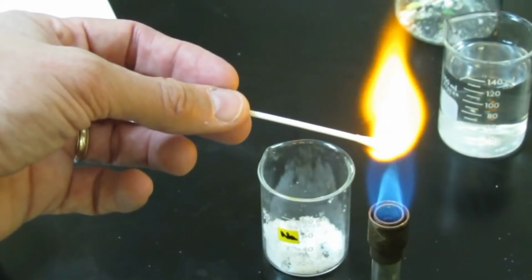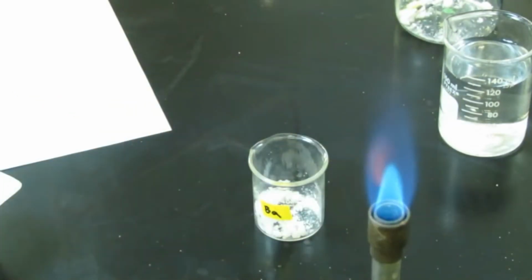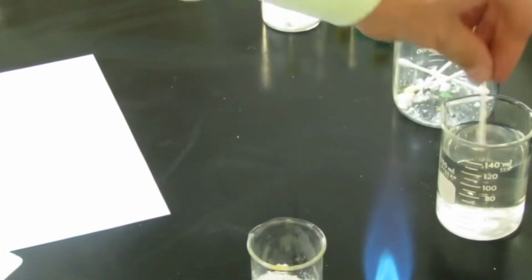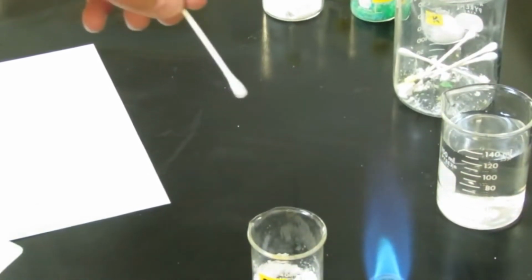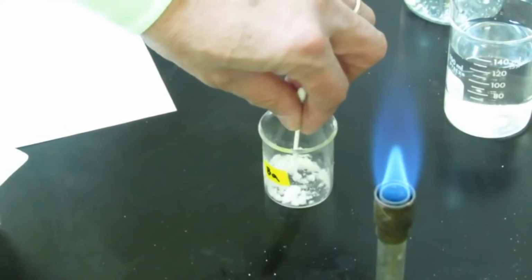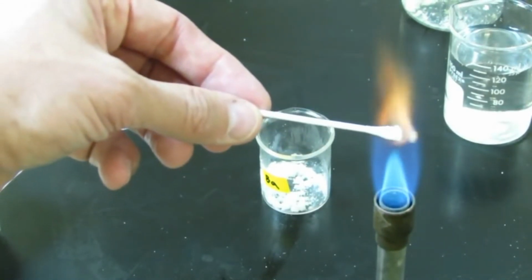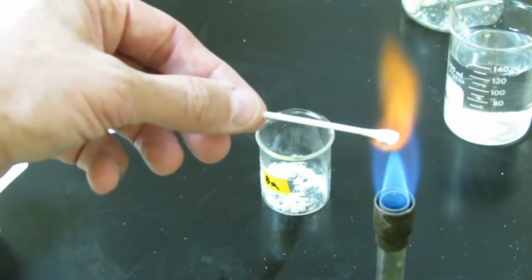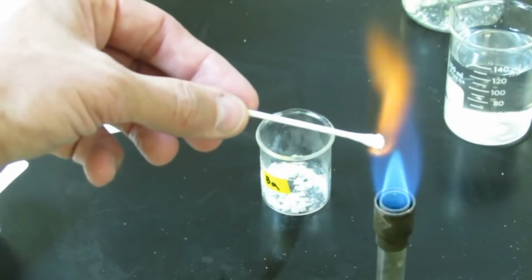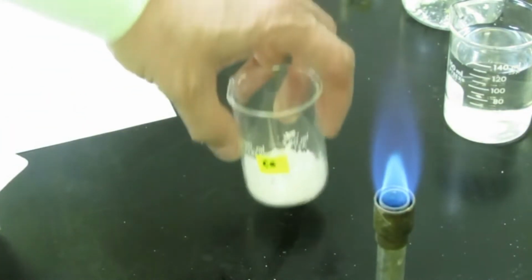Okay. Alrighty, throw that in our waste container, and now we'll move on to our barium salt. So let's get our Q-tip moistened, and get some barium salt on there. Sort of fun, isn't it? That in our flame. Okay. Make your observation. Okay. Get rid of that. Barium's finished. And we're going to go on to calcium.